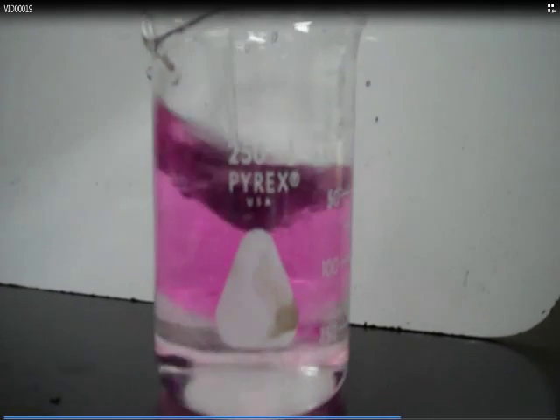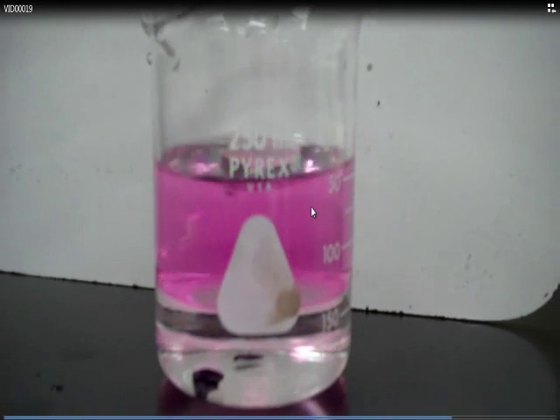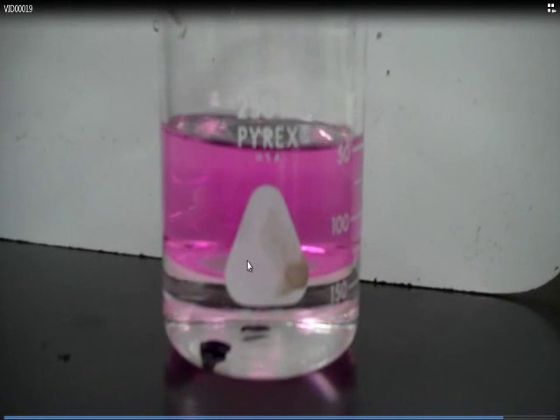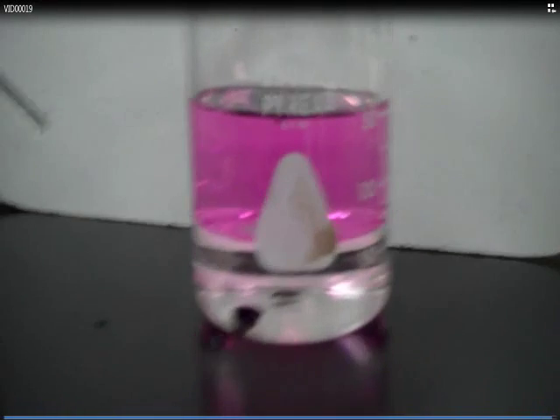Now if Mason pauses, we can see the upper layer becoming purple, which would indicate that iodine is dissolving in the hexane. So in this circumstance, we found that the upper layer is the hexane, the lower layer is the water.